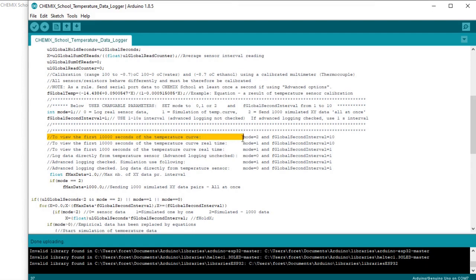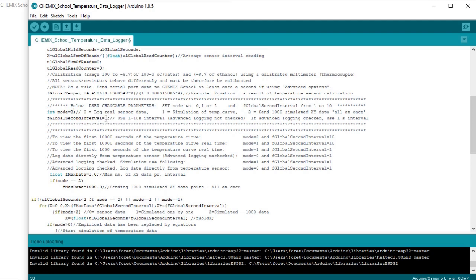In this first simulated logging example, we have to make some minor changes in the temperature data logger sketch. To view the first 10,000 seconds of the water cooling experiment, we have to change two of the parameters in the sketch: set the mode parameter to 2 and the interval to 10.